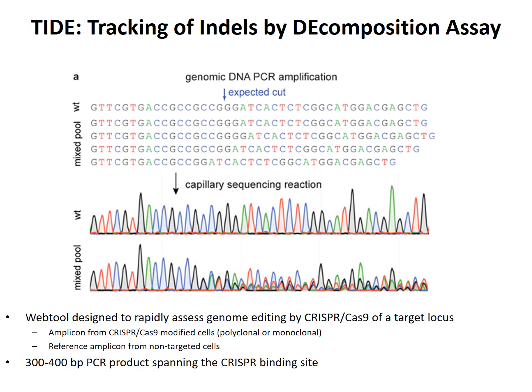And so normally if you do this with a wild-type PCR product, you get perfect Sanger sequencing. And if you have a mixed population where there's been gene editing occurring, there's going to be a bunch of different mutations at that double-stranded break site. And so essentially what you see is really good sequencing, and then right where you'd predict the cut site, the chromatogram becomes garbage.